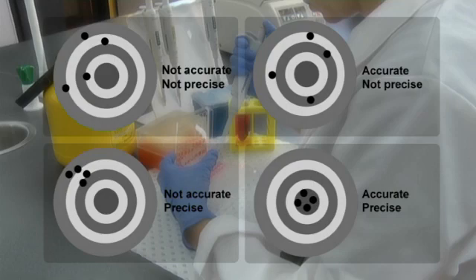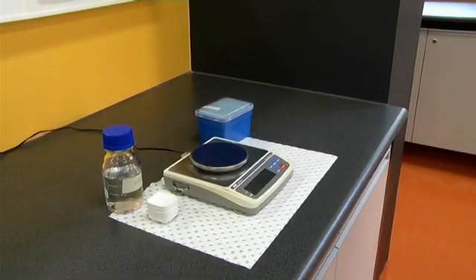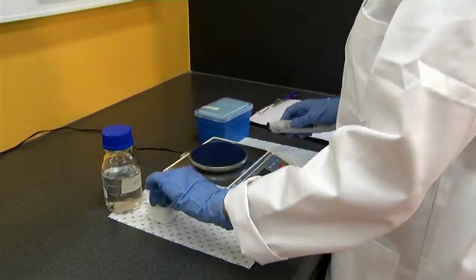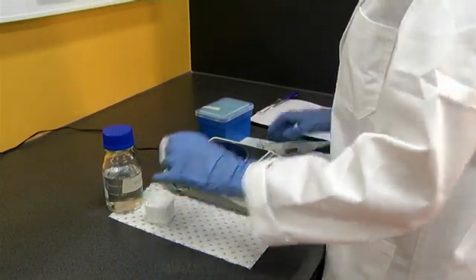So how can we determine if our pipetting is both accurate and precise? We can check the accuracy and precision of our pipetting gravimetrically. That is, we can weigh what we pipet.